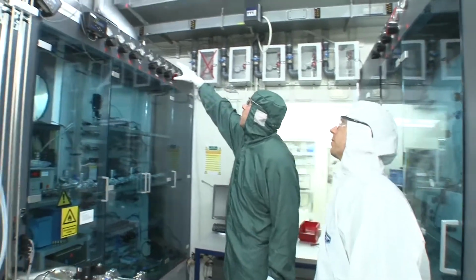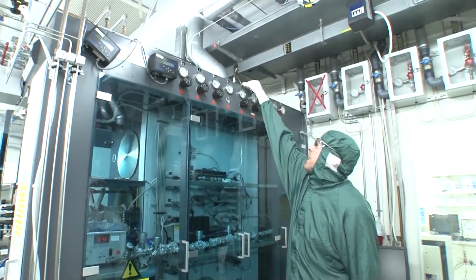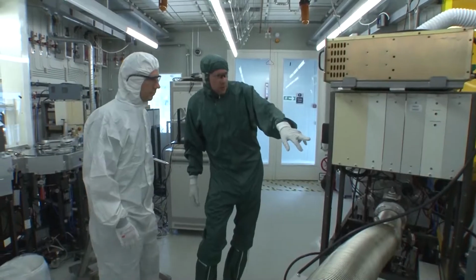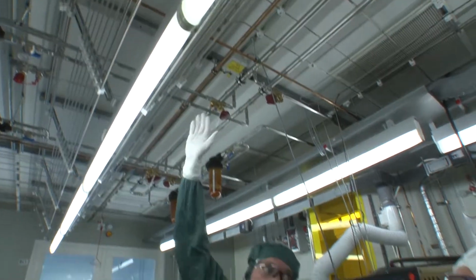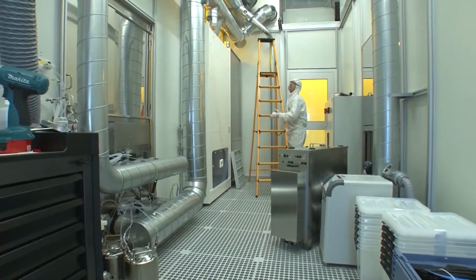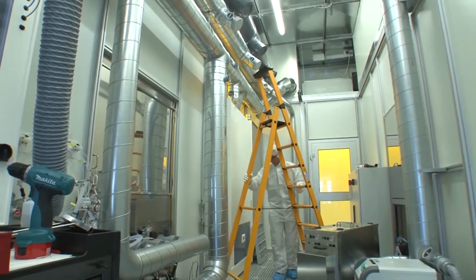We use many hazardous chemicals and gases, and therefore we have an extremely sensitive fire, gas and ventilation alarm system. So it's very important not to touch or switch off technical installations without prior agreement. And never strap things onto gas tubes. This also means that you must pay extra attention as to how you move around, and with what.